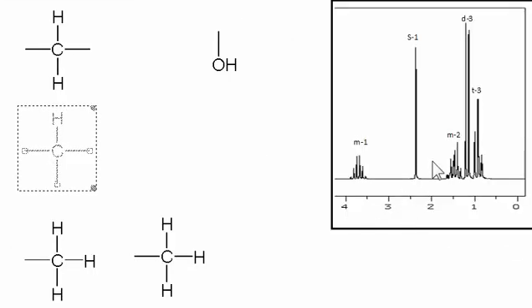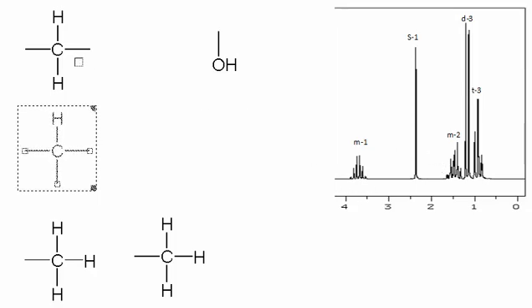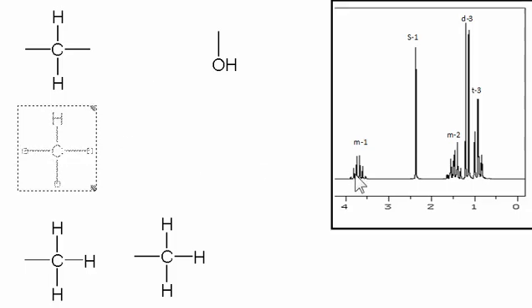So here's my spectrum, and this is what I did. I just made bits of the molecule, and now we're going to put it together. So remember, the multiplet means it has many, many neighbors. The singlet means it has no neighbors.